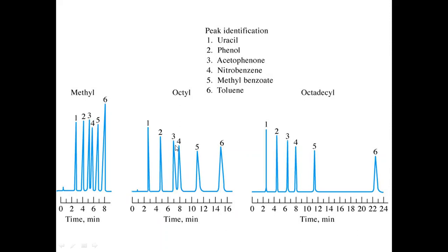If you look at the chromatogram here, there is only slight overlapping between the peaks of solute 3 and solute 4, but there is no overlapping for peaks 1, 2, 5, and 6. The resolution is somewhat improved while using octyl silane. If you replace the octyl silane stationary phase by octadecyl silane, we have further increased the resolution to a maximum extent. The resolution is highly excellent, highly satisfactory, acceptable, but the analytical time was extended to 24 minutes.